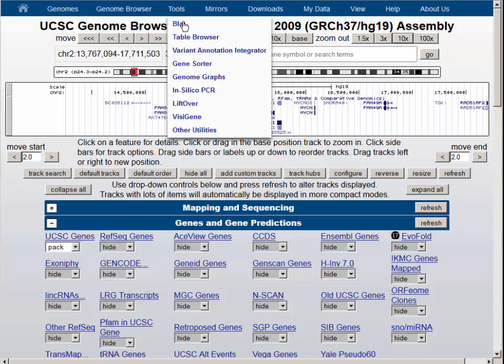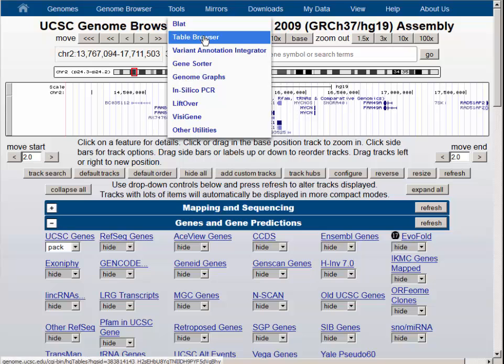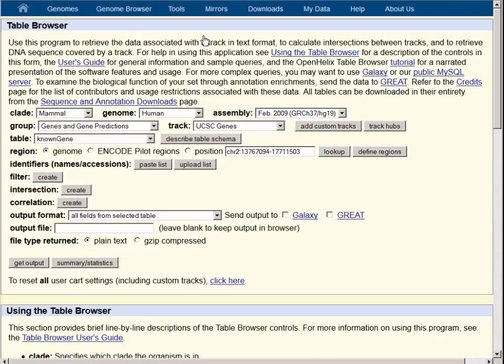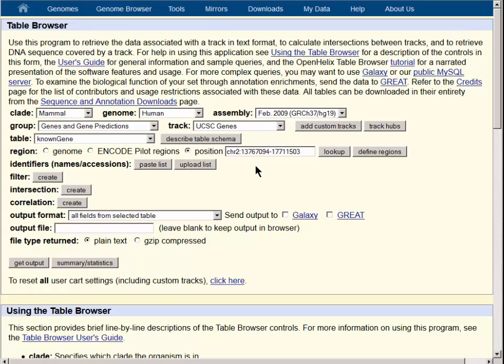Under the tools pull-down menu, we can navigate to the table browser. At this place, we have the default track genes and gene prediction group and the UCSC genes track turned on. We will use the position button to select the region where we were just viewing on the genome browser graphic. The table browser remembers where you were on the browser graphic.